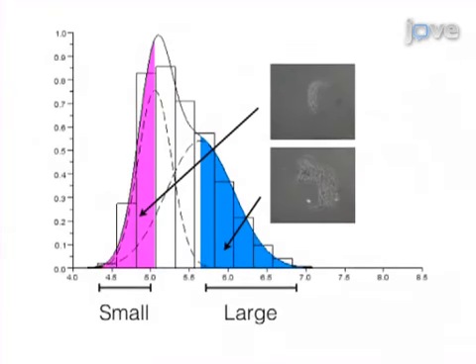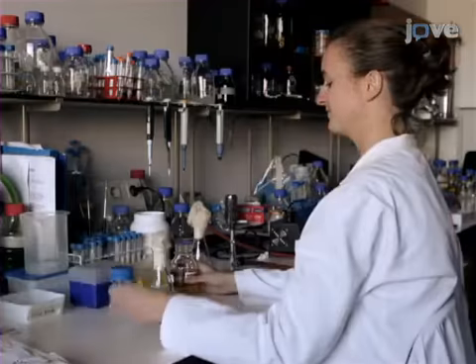Ultimately, these analyses can be used to further characterize the pellet size heterogeneity. Though this method can be used for Streptomyces, it can also be applied to other organisms such as filamentous fungi. Demonstrating this procedure will be Marloes Petrus, a PhD student from our lab.